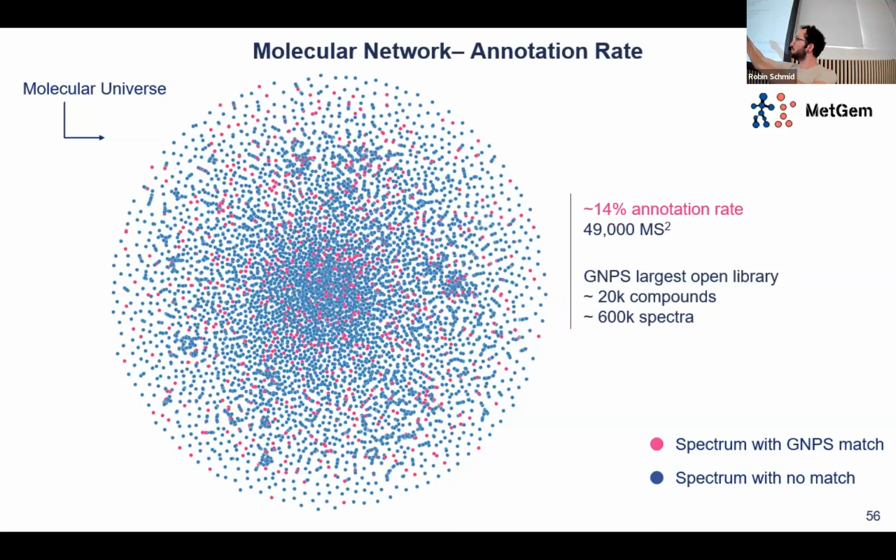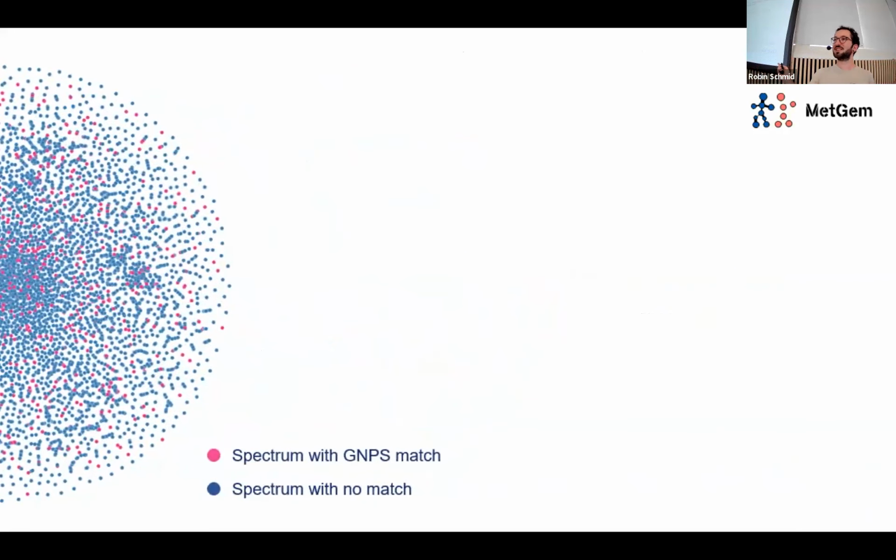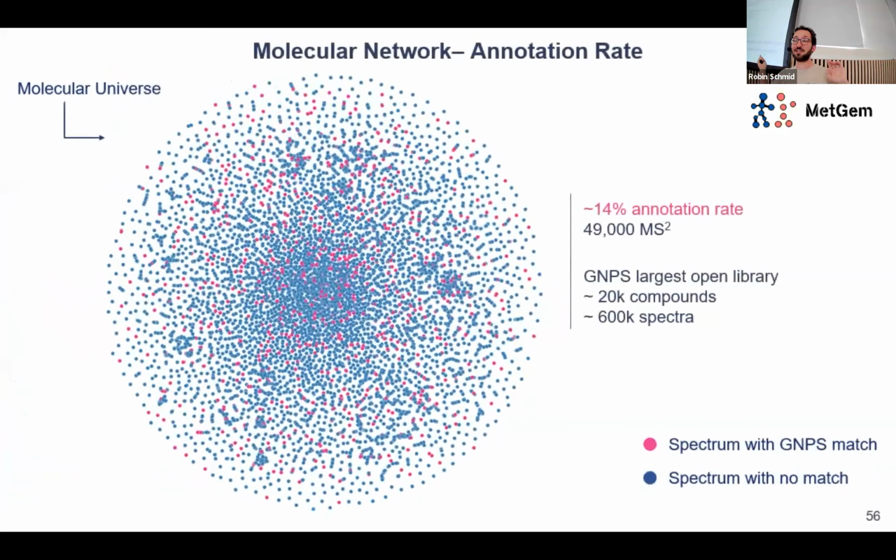And in this view, usually things that are close together should be very similar, but there's no way to see that something that is up there might also be similar to other things. Yeah, just want to make you aware that all the representations flatten a very multidimensional space, and it's very hard to do. And the whole idea that I didn't tell about was that the annotation rate here was actually quite low.